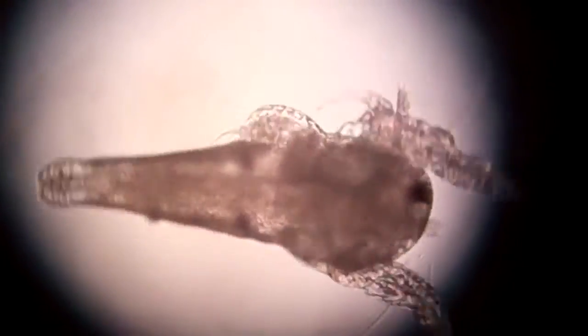Look at that! I found this one. So you see the corner with the plexiglass cover over there? Underneath the lodge you can see his head sticking out, and his tail kind of comes out.